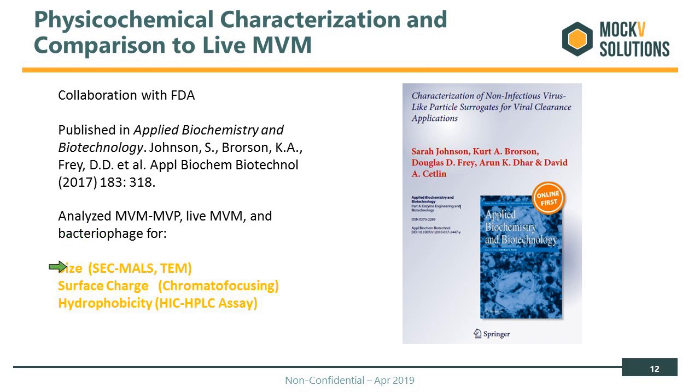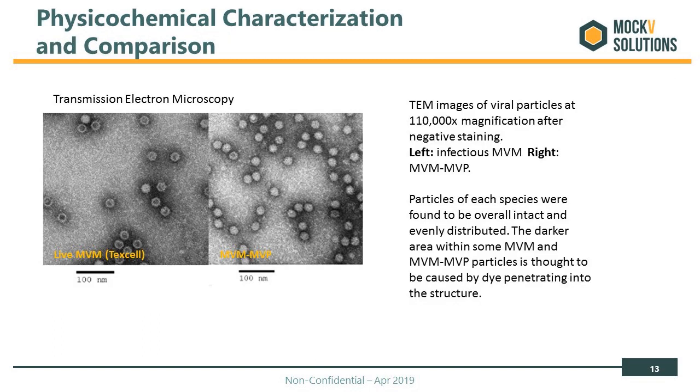We looked at the size of the 3 particles through size exclusion multi-angle light scattering and through TEM. And we were able to measure the surface charge and hydrophobicity of these non-denatured particles through a couple of assays that had been developed and used at the FDA.